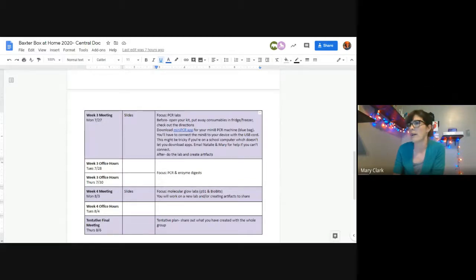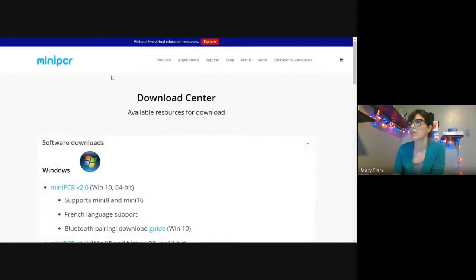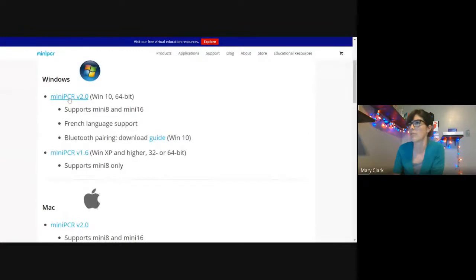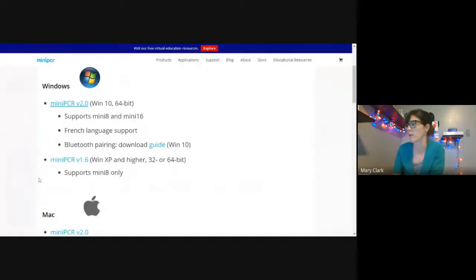If you scroll down, there are lots of different devices that this is supported on. Whatever device you are looking at, you need to make sure that it has a USB port. I'm on a Windows device right now, so I'm going to download this one. That's going to be going for a little bit.